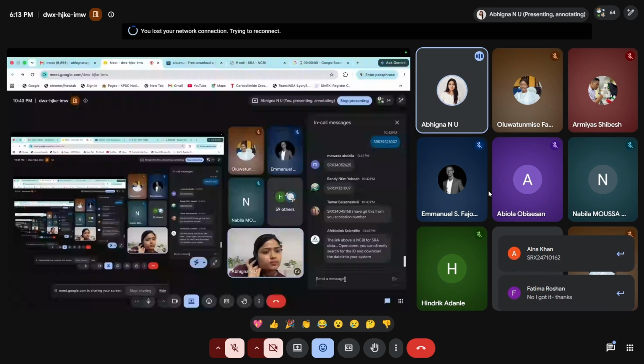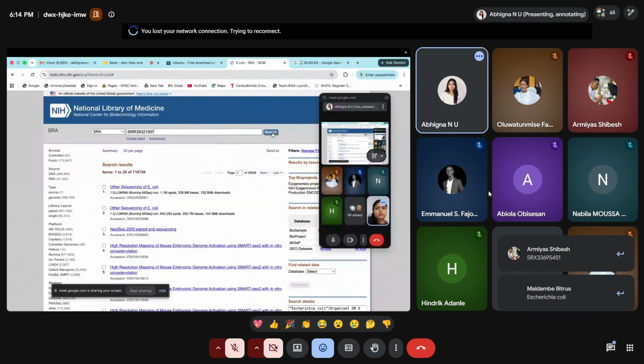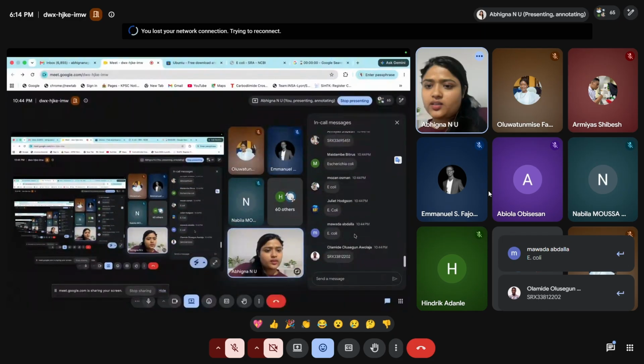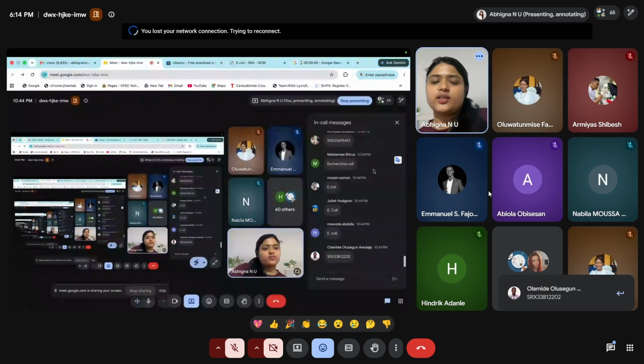Please type in the organism name you got. E. coli, yeah, it is of E. coli.